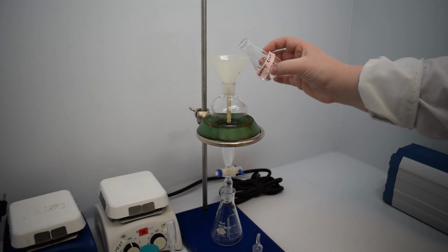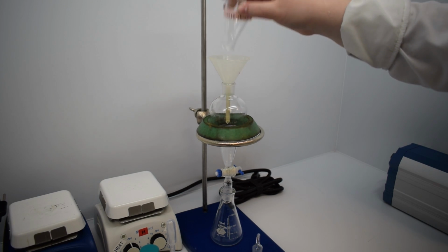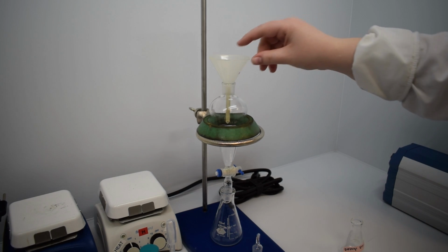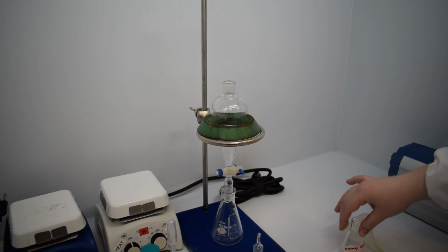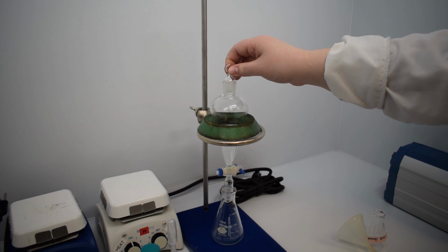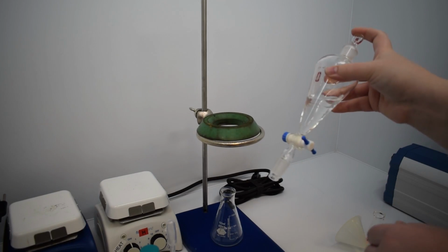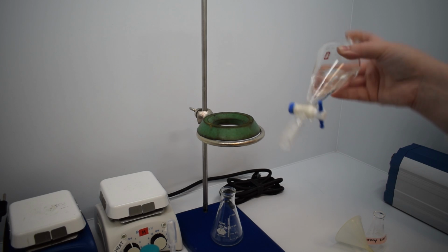We need to add a total of 20 milliliters of diethyl ether. So once the couple mils from the rinse have been added to the separatory funnel, I went ahead and poured in the rest of the diethyl ether as well. Now that everything has been added to the separatory funnel, we put the cap back on and then take it out of the iron ring to start the shake and vent process.